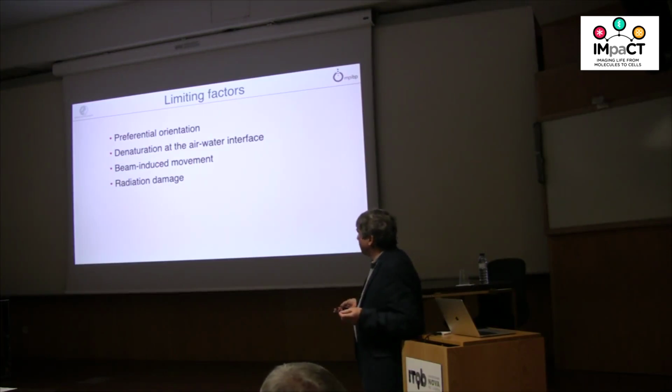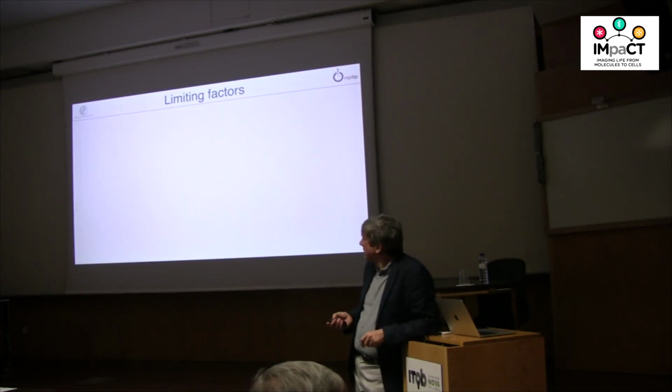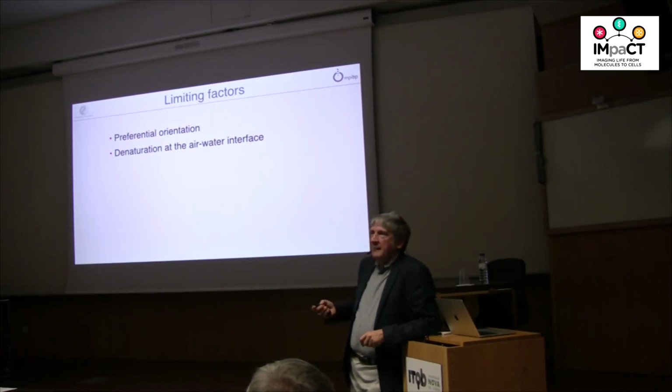Werner. Yes. Sorry. Regarding the preferential orientation, if you don't have a spherical particle, is there any way to polarize the slide to make some preferential orientation?